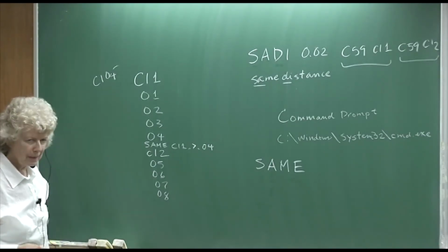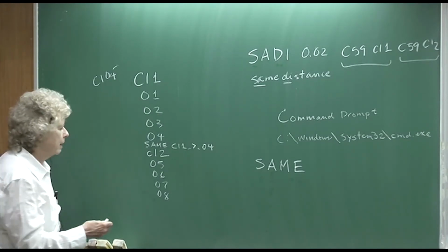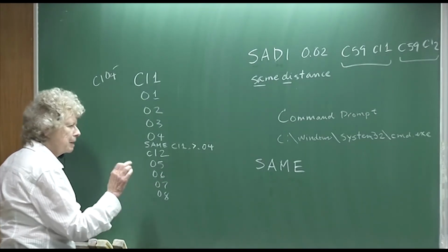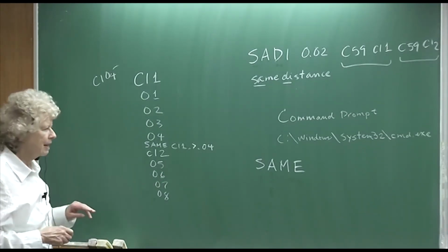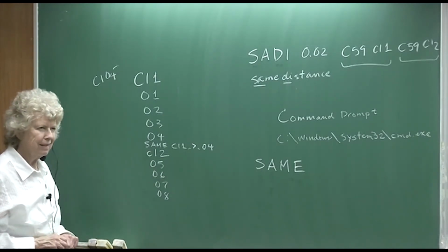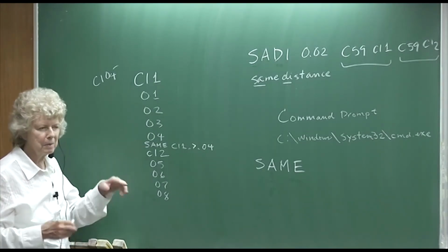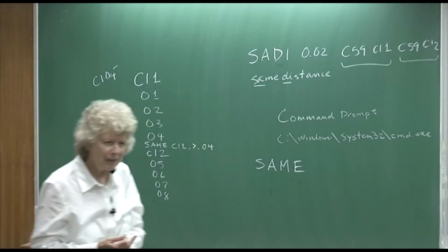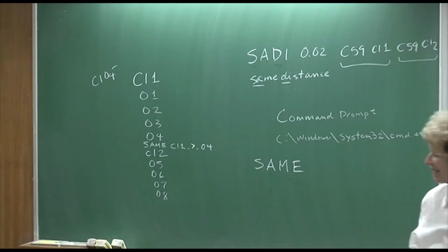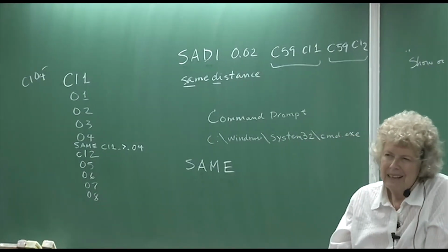It's basically considered a restraint, not a constraint. The DFIX is more of a constraint. It sometimes works. There is one problem though, that when you refine with the SAME command, it isn't saved for some reason. So you go back to your INS file and the SAME command is gone. And then there's a message that says, SAME must be entered again. So you have to remember where you put it in the file and put it back in, if you need it again.